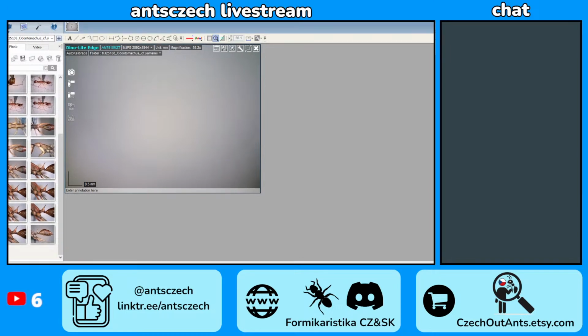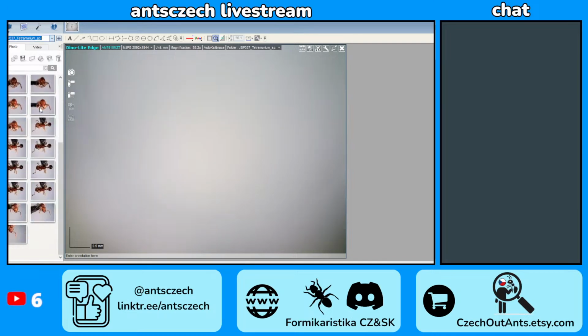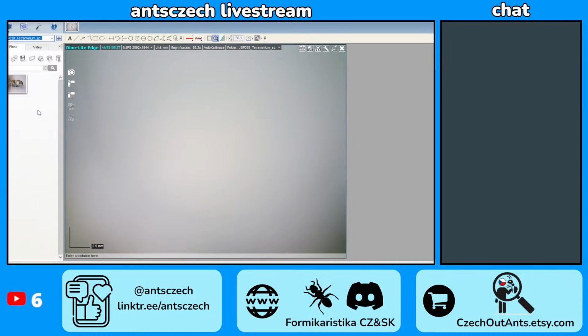Oh, now I changed the view. It should be visible in the live stream. Oh yeah, you see it fine. Dino light edge. There's no my finger. Okay. So I have to check what specimen I was doing. I was doing this one. 47. No, 48. I don't have 48. Okay.